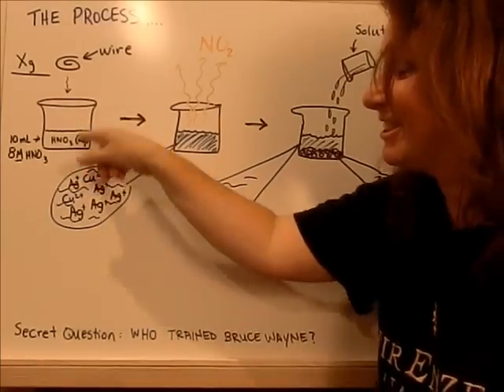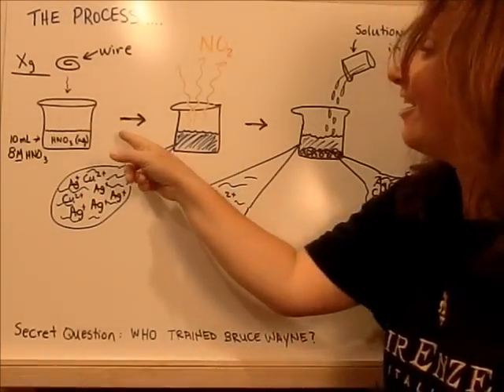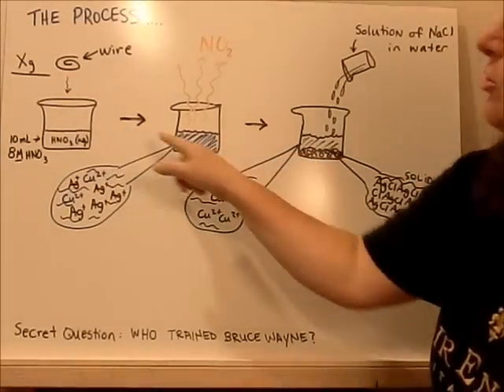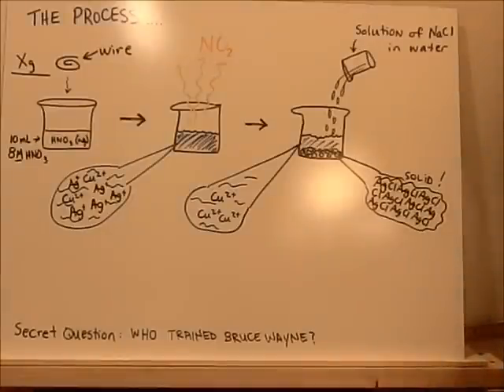Okay, so you dissolve it in the nitric acid. All right, and here's what you're gonna see. You're going to see a clear solution turn blue. I'd like to throw it out as a little extra credit for you guys to see why. Why does the solution turn blue?